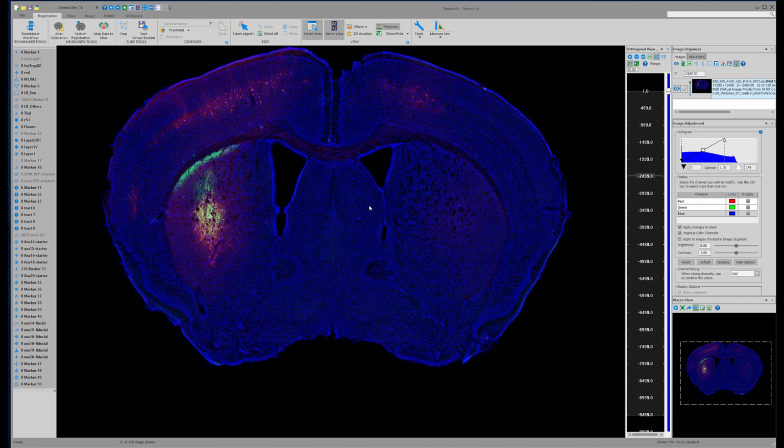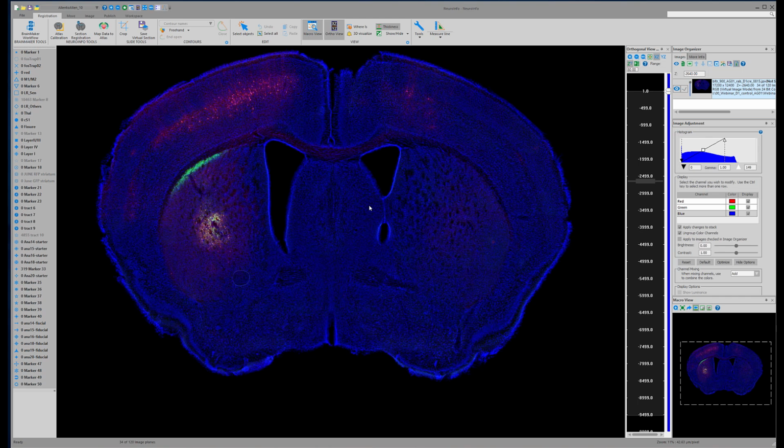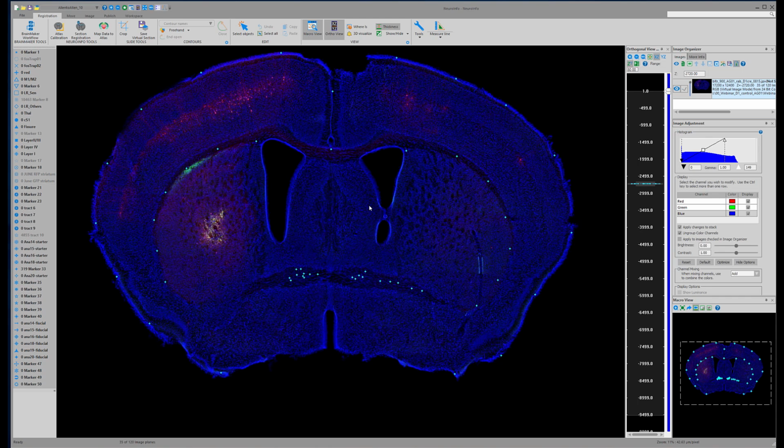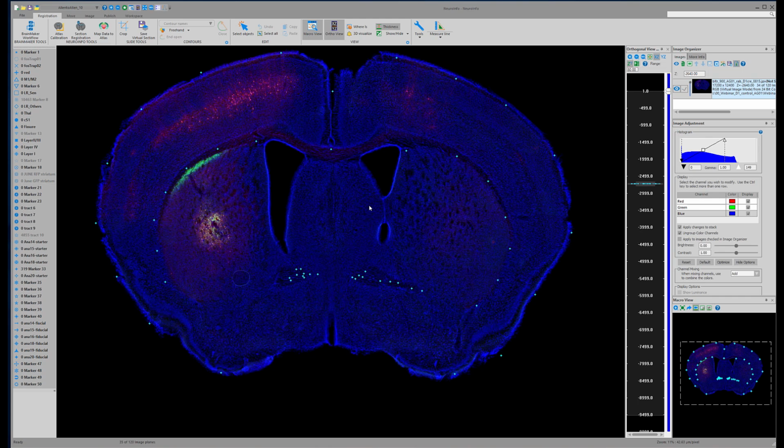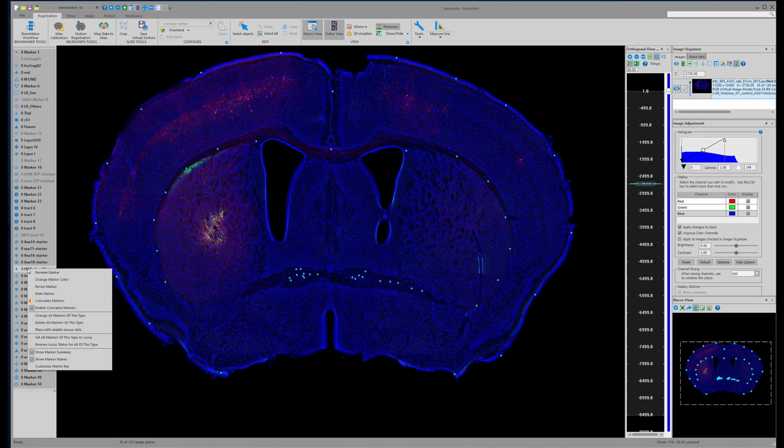So Chip, just a question. These fiducials are so that you can get a measure of accuracy. They're not required for the registry. Not at all. Yeah. I just like to use them because we go through and we want to see how accurate the registration is to the Allen space, and these help. And once they're cast or matched into the Allen space based on the image matching to the Allen space, what's a typical accuracy that you're seeing out of this matching process?